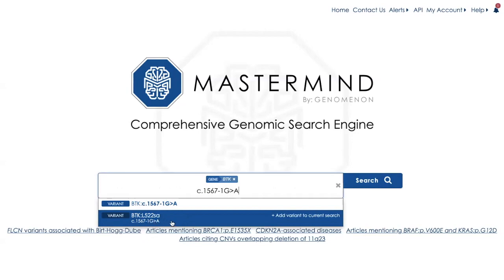This is one capability of Mastermind we want to be sure to highlight. When you see the BTK L522SA, that is indicating that this is a likely splice acceptor variant. There's a list of the abbreviations we use for this Mastermind terminology on our frequently asked questions page.